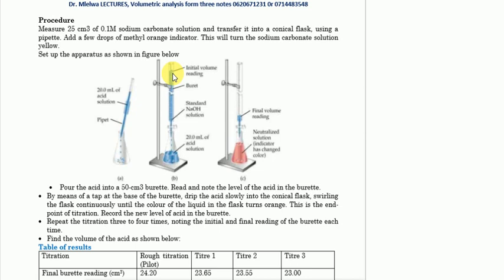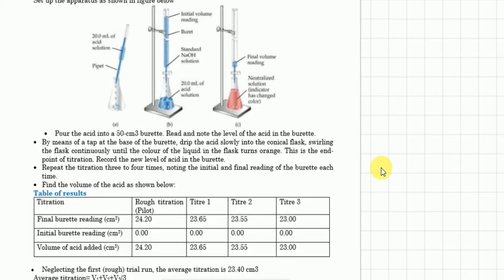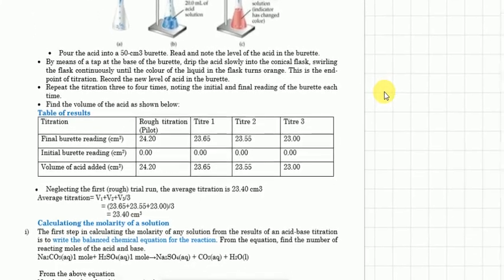So actually putting a base in a burette, no, that's not correct. I am disagreeing with this. Normally the acid is the one put in there, and normally when we are calculating this mean titre volume, it's the volume of acid below here.